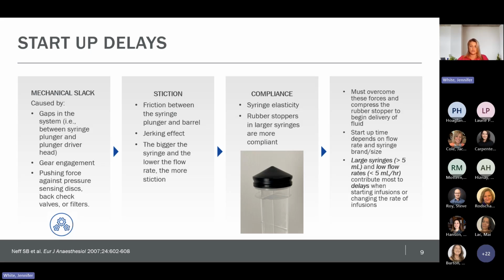Also, when a pump is started, it initially has to push against the downstream pressures, such as your sensor disc, your back check valves, or your filters, until the pressure is equalized. So any accessory device that's added, the pump is going to have to work against.